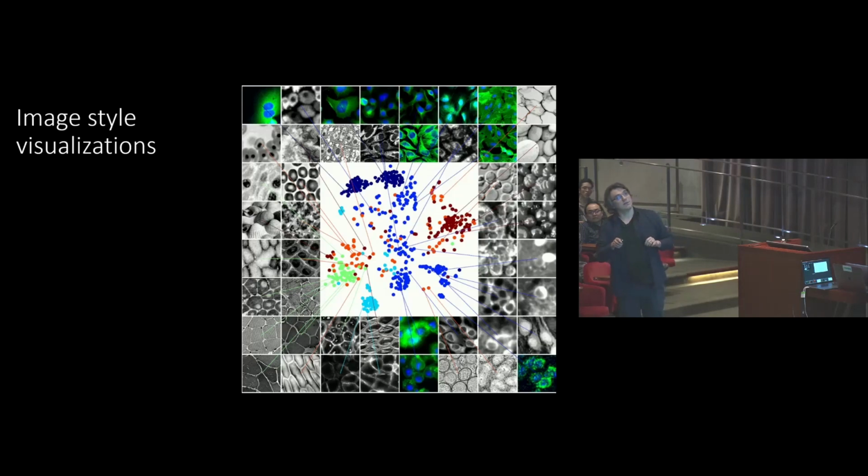And if you take a moment to look across, you'll see there's both some dual channel images, like the ones that have nuclei, so DAPI, the green and blue ones. There's a lot of grayscale. Most of these are cytoplasmic markers of one sort or another. There's some bright field microscopy in this corner. There's also some that are not cells, that are actually, like here you can see fruit and seashells, fruit, and so on.